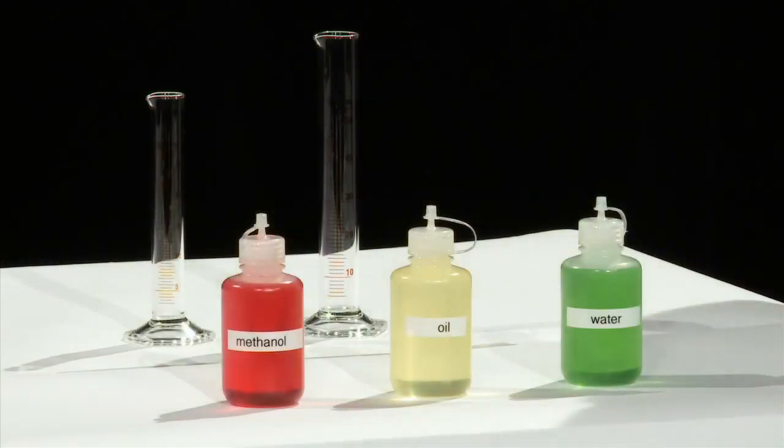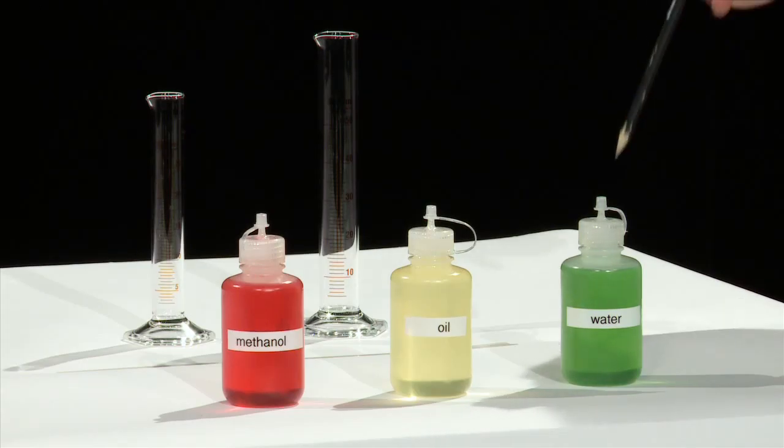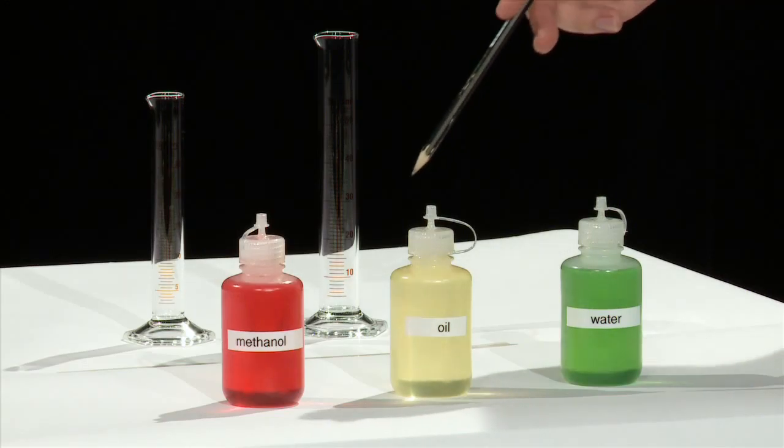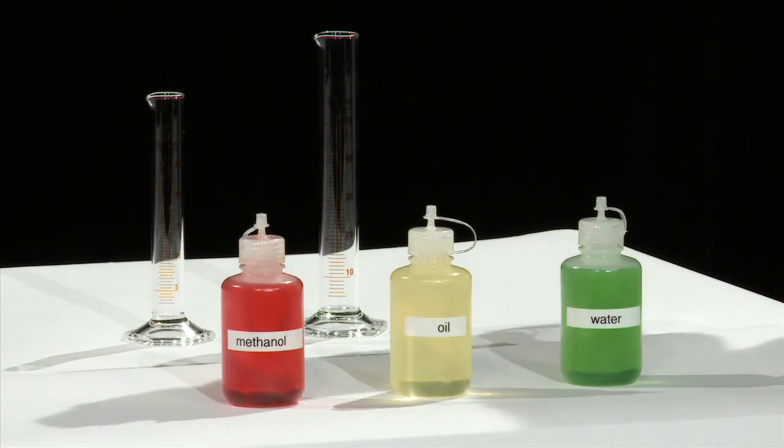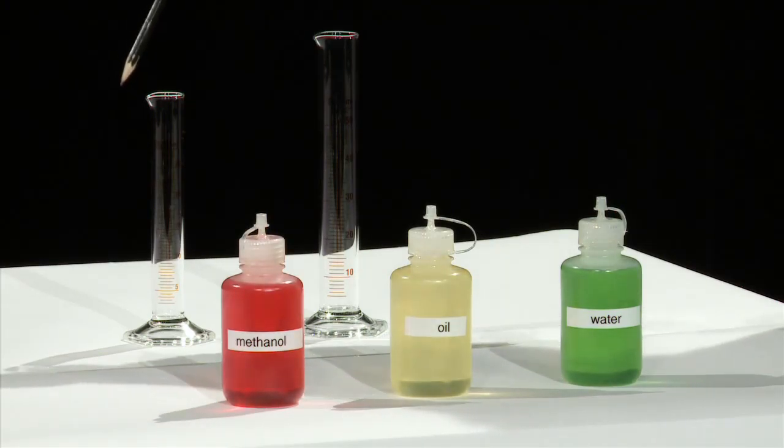For this experiment you will need a bottle of water with some added food coloring, a bottle of oil, and a bottle of methanol with a different color of food coloring. You'll also need a 50 ml measuring cylinder and a 25 ml measuring cylinder.